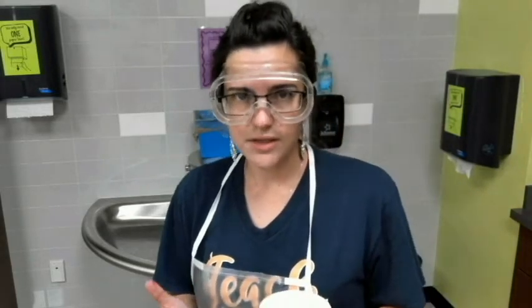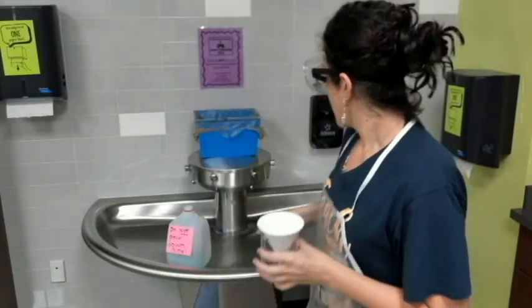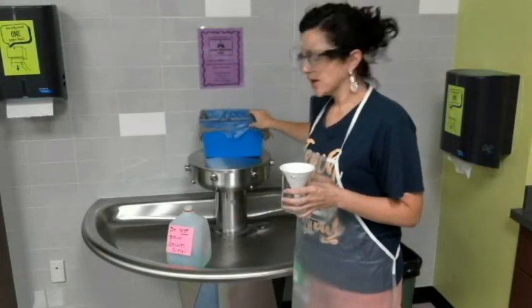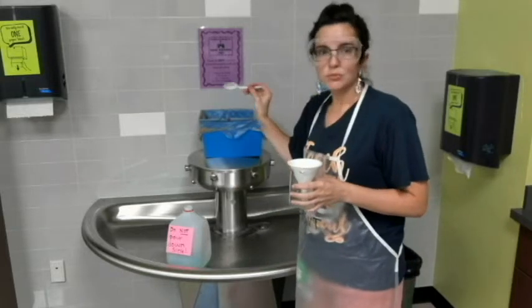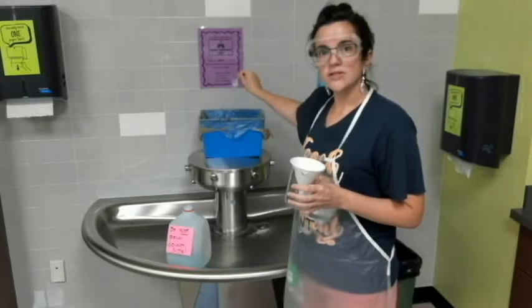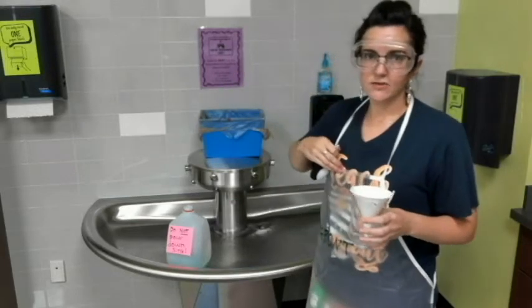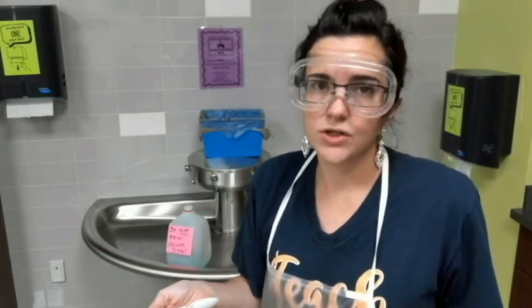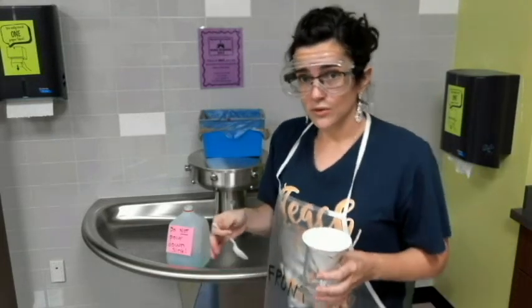The same situation might go if we're working with sand or soil, pebbles, stuff like that. We don't ever want to put a huge chunk of those items down the sink. So we might have a bucket that looks like this, where we will say, okay, everyone, take your scoop or your spoon and put all of the dirt and soil and pebbles in there, and then I will take care of that. I'll either put it in the trash can or I'll let it air dry so that we can reuse that sand in the future. But that's up for me to decide on what we do with those certain items.